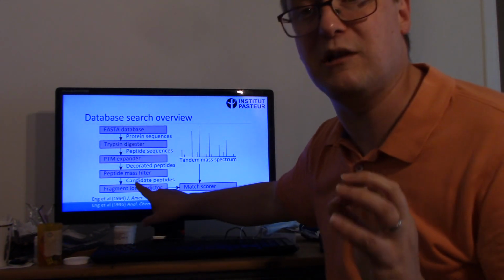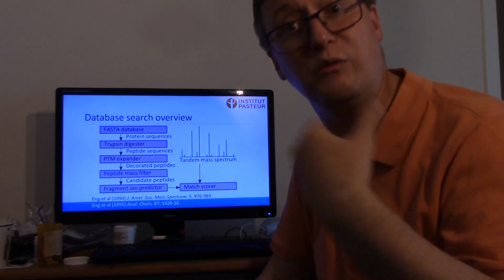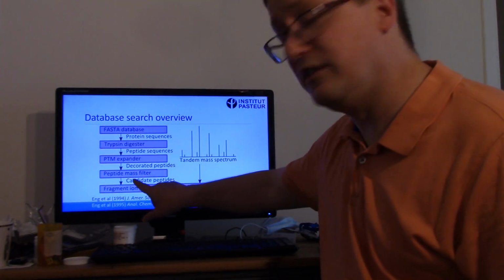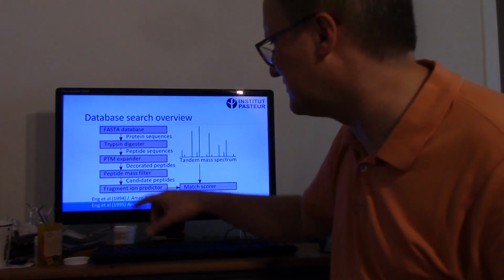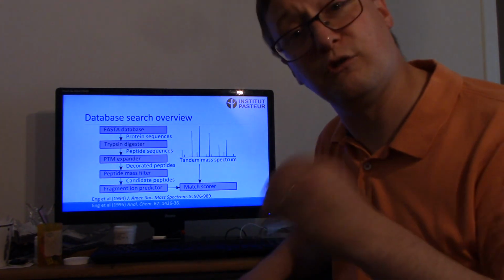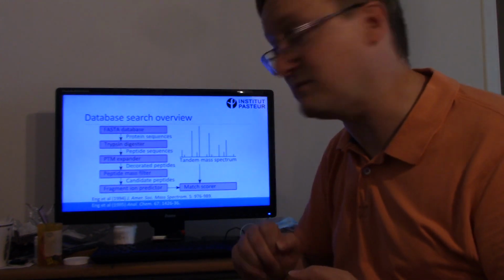Therefore, we only need to compare peptide sequences that agree very, very well with what we saw when we measured that intact mass. But typically, this comparison is not taking place just on the basis of precursor masses. Instead, we need to be able to compare the fragments that should result from this peptide sequence to the ones that we saw in the tandem mass spectrum.